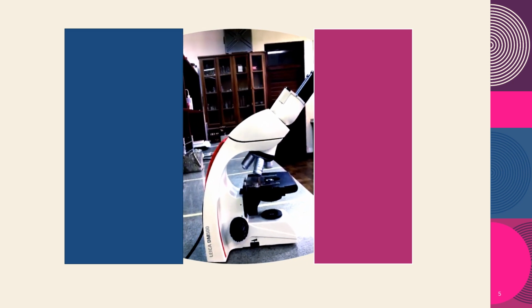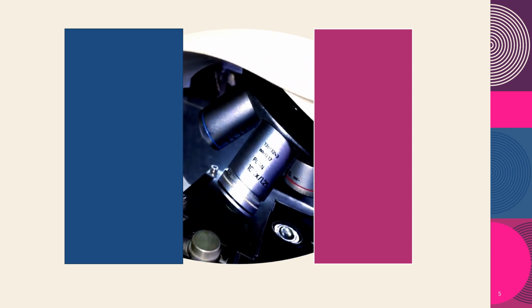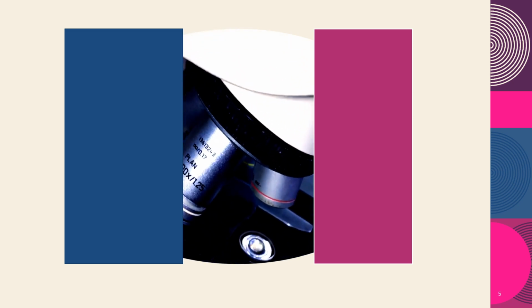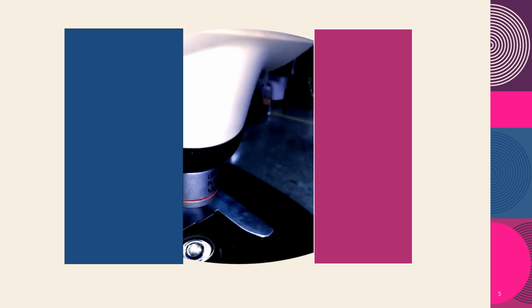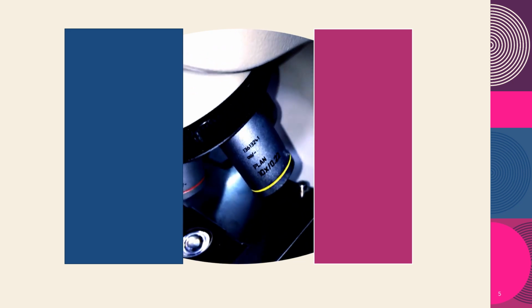Sorry, my video has moved back. Okay, let's continue. Right, so ×4 red color, then we have the ×10, showing the yellow color coded.